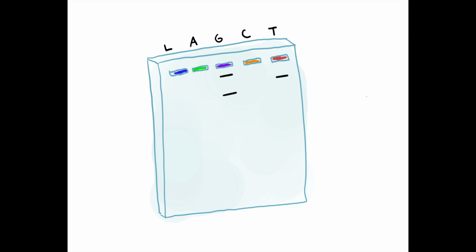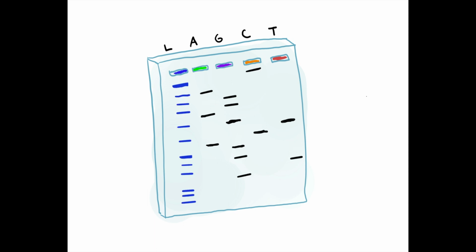The shorter DNA fragments are going to sift through the gel faster than the larger ones, so you'll see them separate out like that. So as you can see, the bottommost band is in the G column. So the first nucleotide in the sequence is G, and it's going to be on the 5' end, and that's because DNA synthesis occurs 5' to 3', so it's G. Then the second from the bottom is going to be the T band, as you see there, and you just put T next, and then it's going to be G again, and then G again, and you go and you see, oh, A is next.